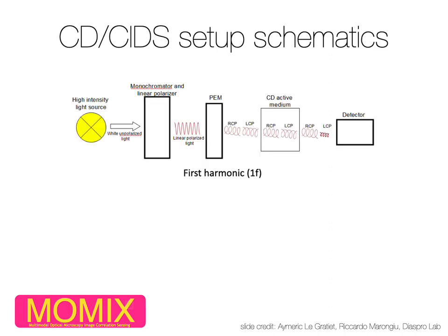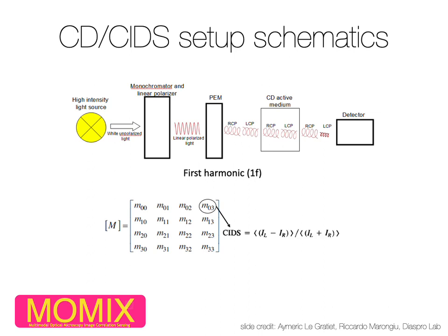So, you control polarization of light, you insert your sample, and you detect the changes. In case of circular polarized light, I mean when circular is right or left, in case you meet superhelical structures or helical structures, you can find information related to the way these helical structures are compacted.